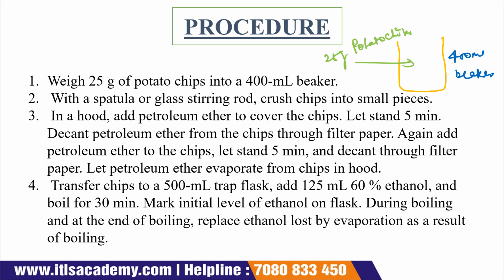we have to crush the chips. Suppose that this is your potato chips. Now with the help of a glass spatula or a glass stirring rod, suppose that this is your glass stirring rod or spatula, we crush it into small pieces. Then inside the hood, so that it will not catch flame, we add petroleum ether into it.